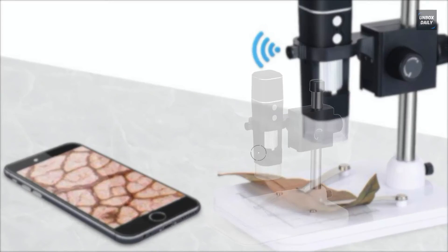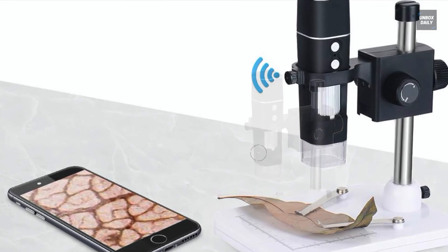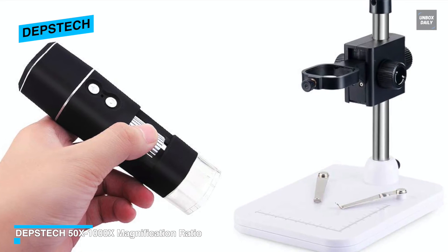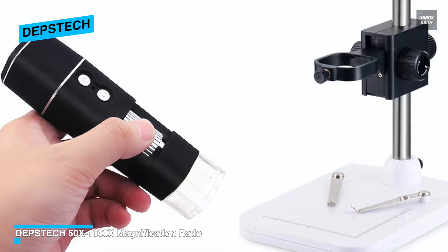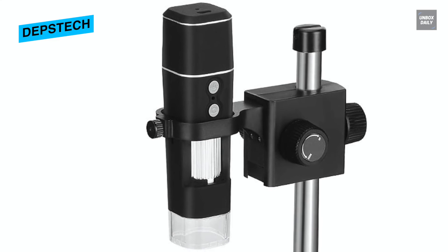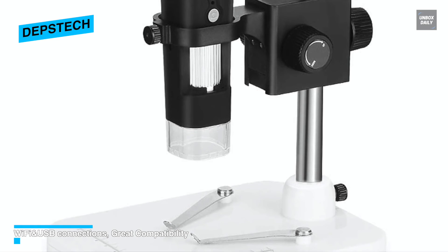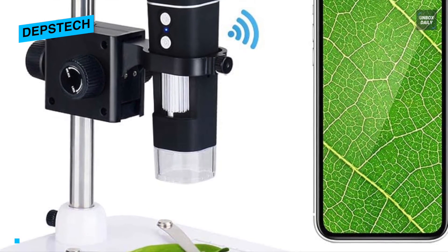This digital compound microscope features high magnification for clear video on iPhone, Android, and PC, along with HD photo capture and video recording via the bundled app. It includes a 1-megapixel camera compatible with iOS 6.0+, Android 2.3+, and Windows XP, Vista, 7, 8, and 10 (except Windows 10 Pro). Built-in 8 LED lights with adjustable brightness and a detachable metal stand make this a compact and versatile microscope. A free driver is available for download on your phone or PC.